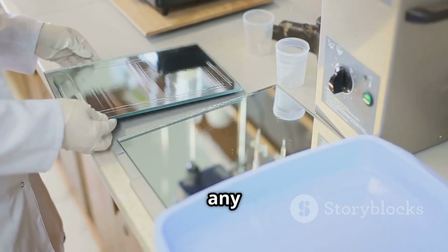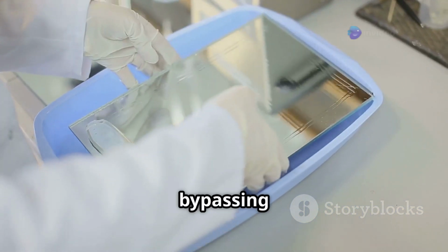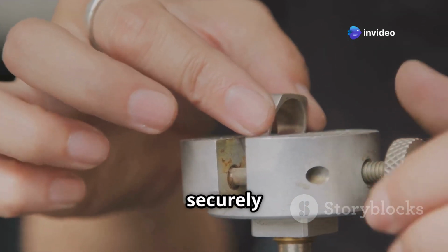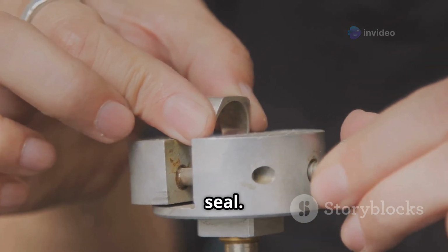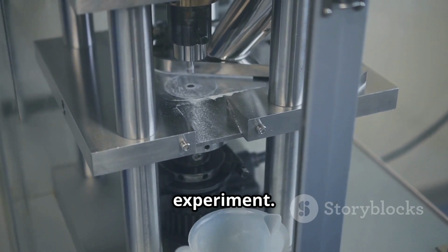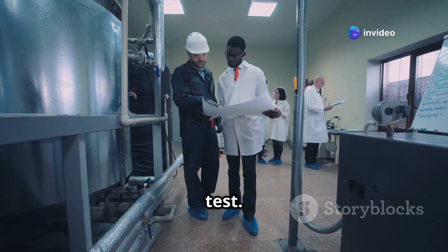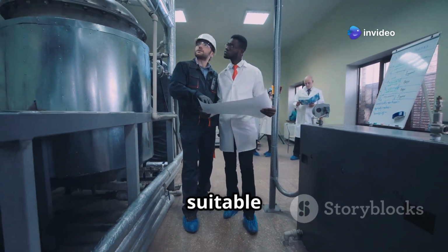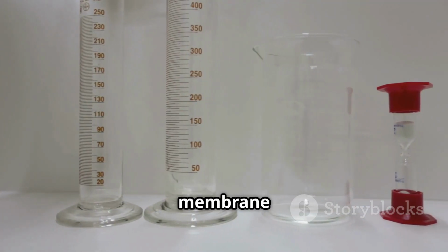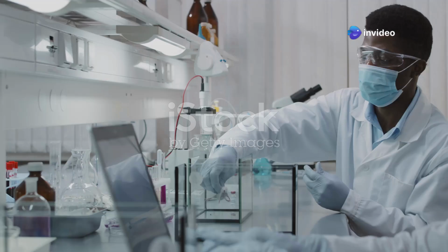It's vital to avoid any wrinkles or air bubbles that could create channels for the gel or ointment to leak through, bypassing the membrane. Once the membrane is in place, the two halves of the cell are securely clamped together, ensuring a tight seal. This prevents leakage and maintains a constant diffusion area throughout the experiment. After assembling the cell, it's essential to perform a leak test. This involves filling the receptor compartment with a suitable solution and visually inspecting for any leaks. A properly mounted membrane should prevent any fluid from passing through, guaranteeing the experiment's integrity.